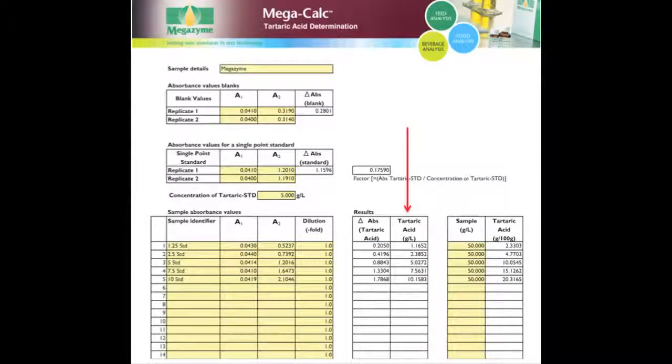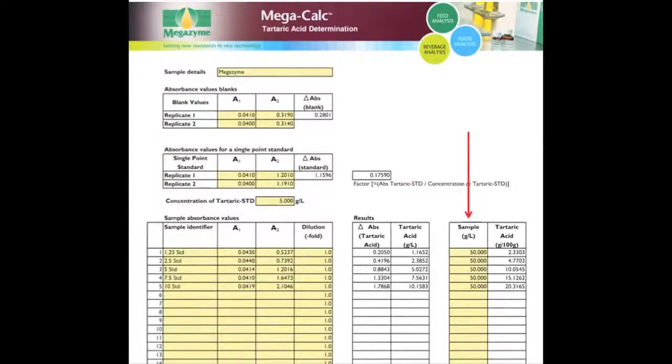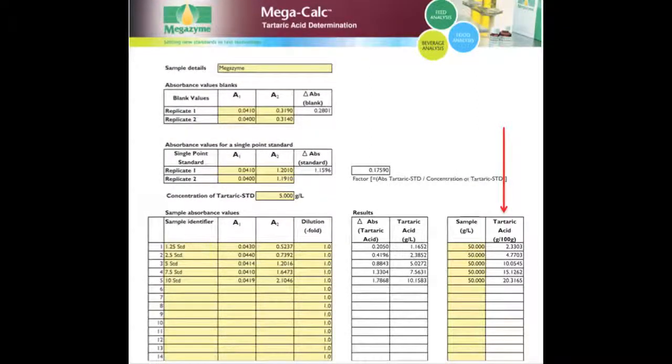For liquid samples, results are automatically calculated in grams per litre. For analysis of solid samples, enter the original concentration at which the solid sample was dissolved or extracted in grams per litre prior to the analysis. Once all the data has been entered into the spreadsheet, MegaCalc automatically calculates results. This can then be printed or saved electronically.